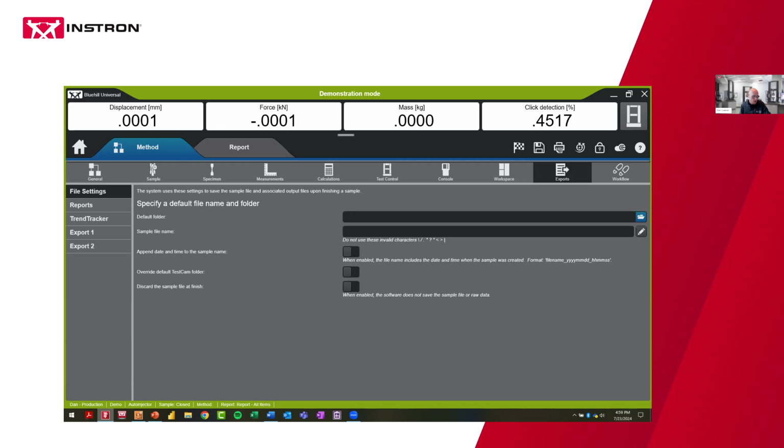Last 2 questions, 1 minute. Are test methods related to a standard like ASTM? Are they modifiable?